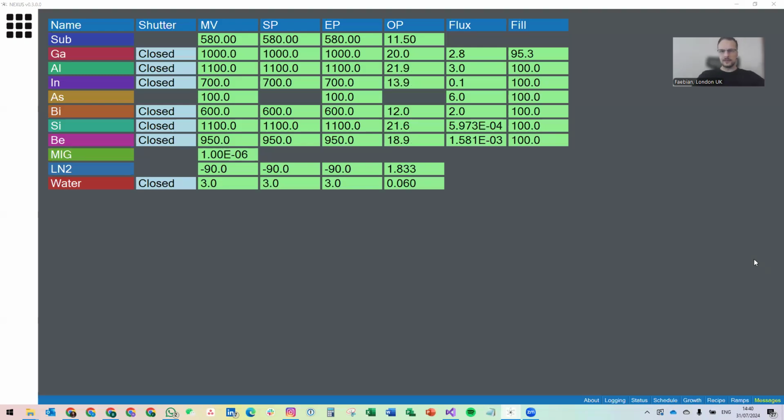Right. In the last video, I showed you how you can record beam equivalent pressure and flux data automatically. In this video, I want to show you what you can do with that data. So once you've got that data in, there's a couple of neat things you can do.